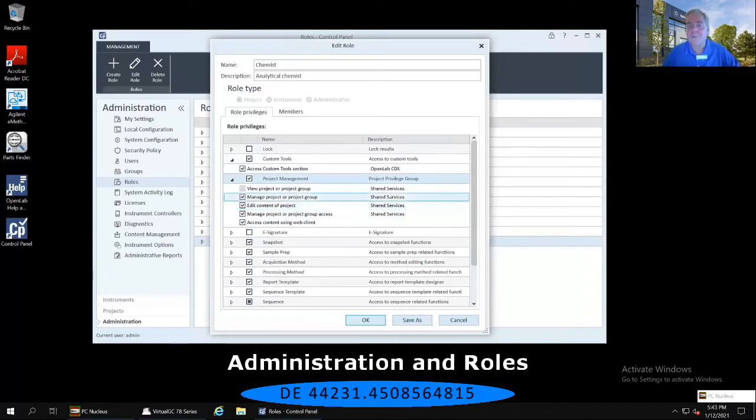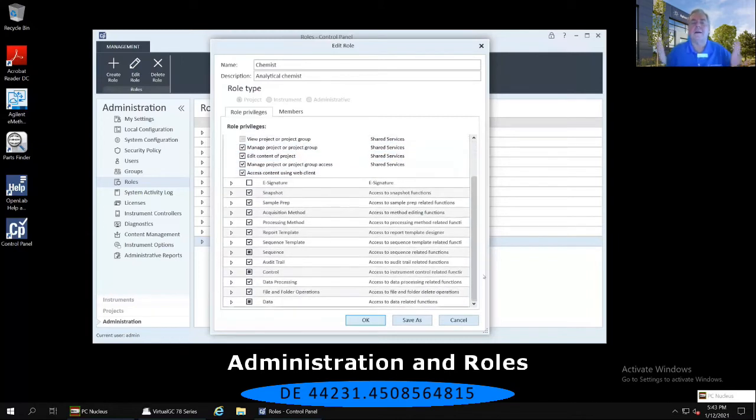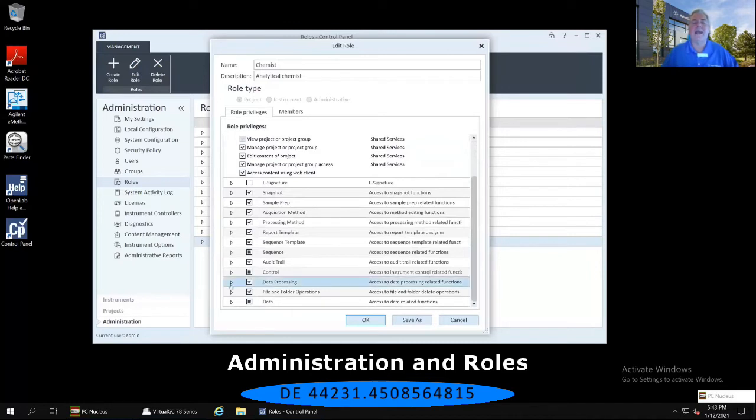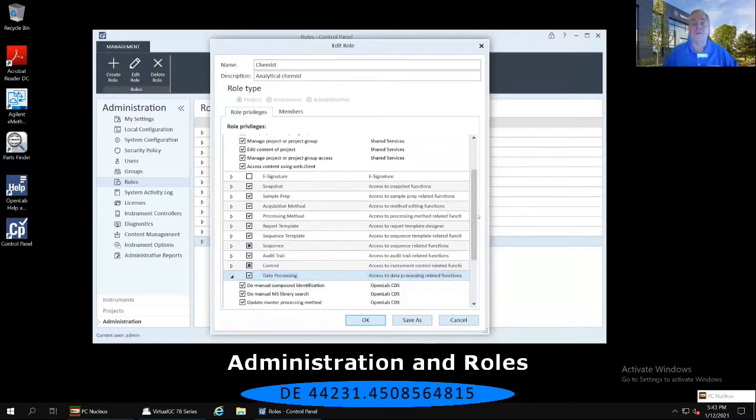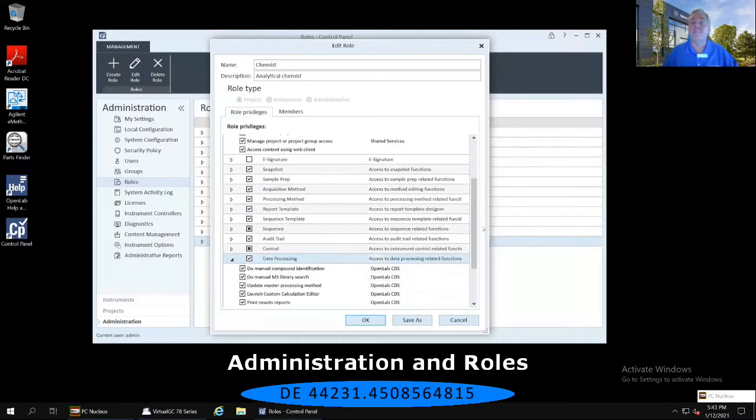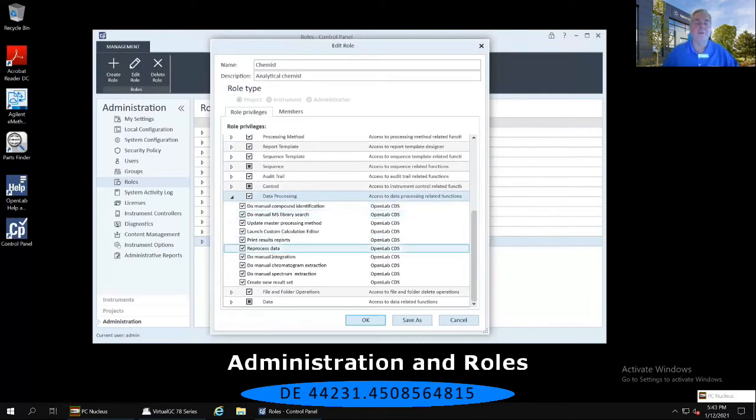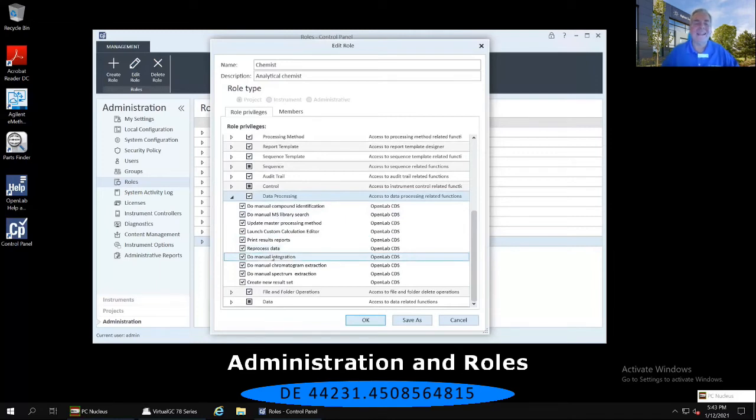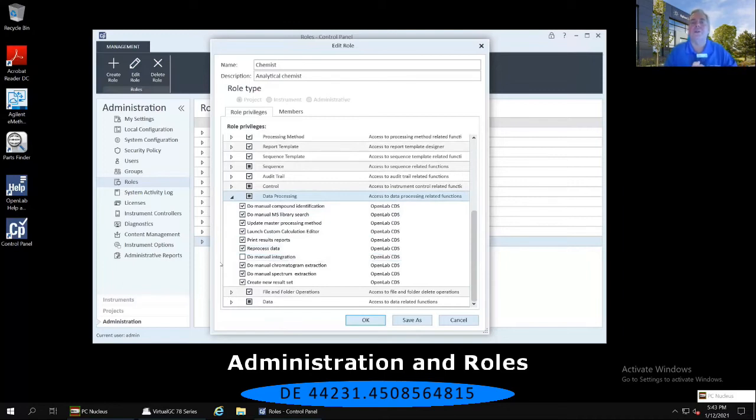To find that specific item, if we use the scroll bar on the right-hand side of this edit role window to go down a little bit more, I want you to select the right-facing arrow to the left of Data Processing. That expands all the sub-privileges available for the data processing section of the software. One of the items, about two-thirds of the way down, says to do a manual integration. If I deselect that by clicking on that checkmark, it deselects and therefore forbids whoever is assigned the role to do a manual integration.